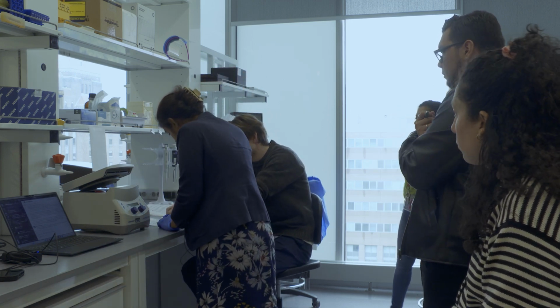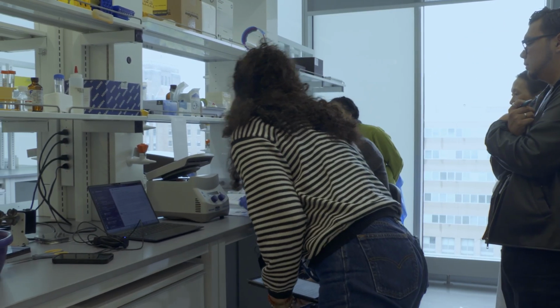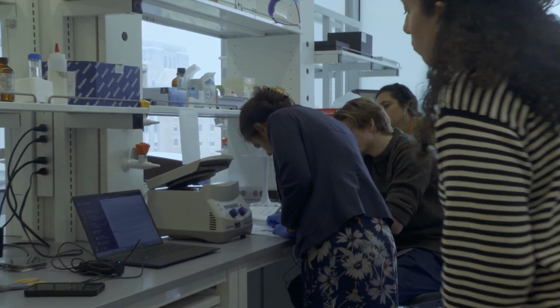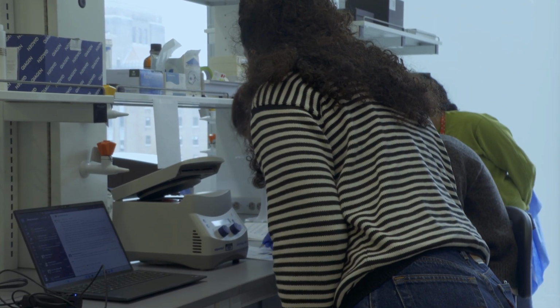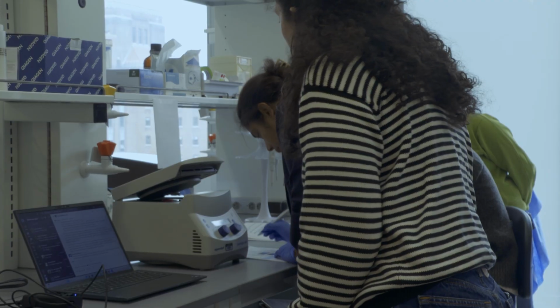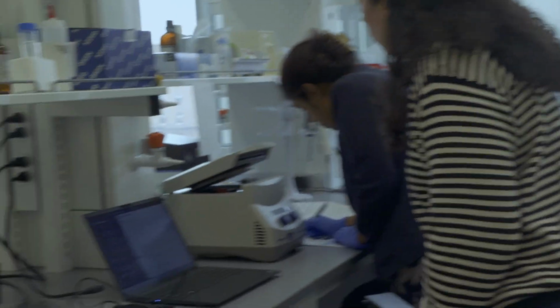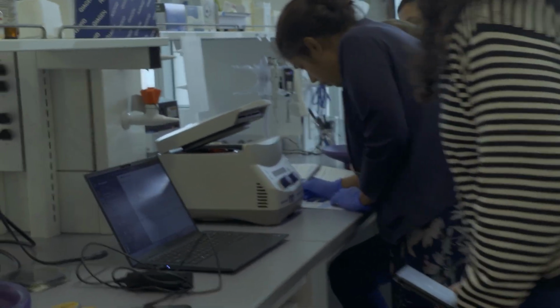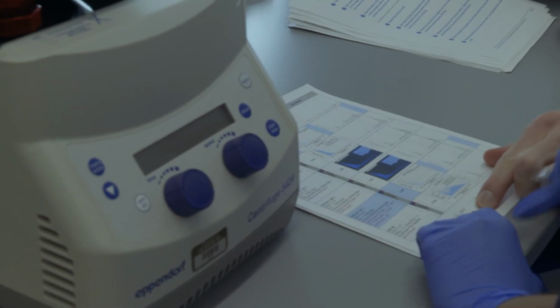So let me draw your attention. This one, I think, is our best. Yeah, it still has something right here. Correct. But this peak I can see. This is probably a good one. There are two numbers. What are these numbers? 260 over 230 is first. The first one, over the 260. No, 260 is the second one, right? 0.07. Yeah. So number one, number two.